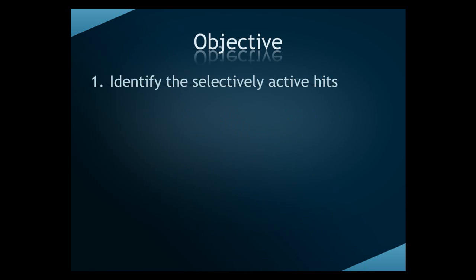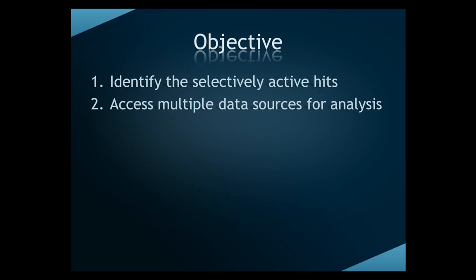So the objectives in this demonstration are to identify selectively active hits that have been recorded in a number of screens. And of course, the second part of this is to demonstrate how we can access the multiple data sources for the analysis.